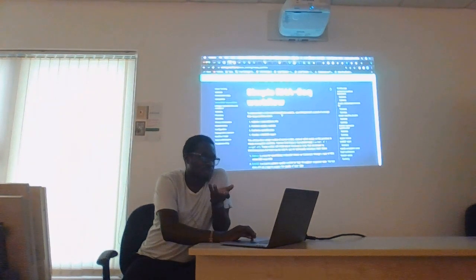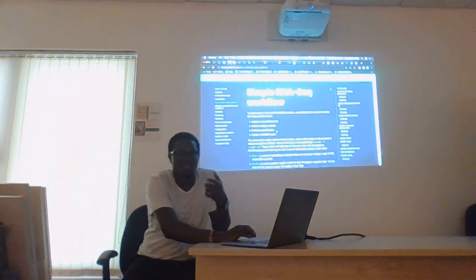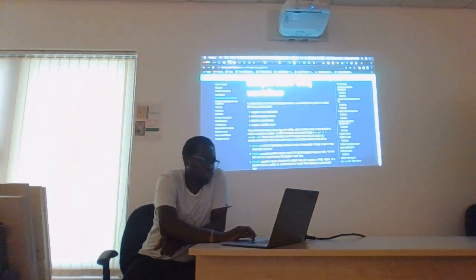So the workflow basically performs indexing of a transcriptome file consisting of transcripts. It's in FASTA format. It performs quality controls. It performs quantification. So you have some raw reads which you need to quantify in terms of the transcript abundance, and then create a MultiQC report.